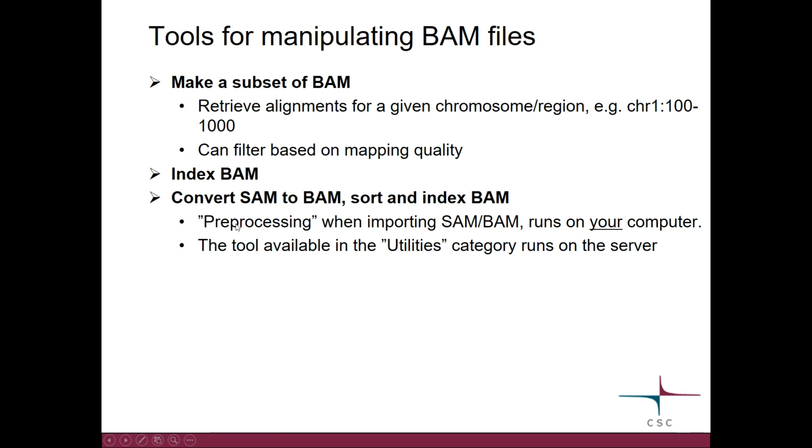Now, this pre-processing question, when you say yes, this pre-processing will happen on your computer, but it's perhaps better to say no at that point and then run a tool in the utilities category, which will do this, because this tool will run on the server side and not slow down your computer.